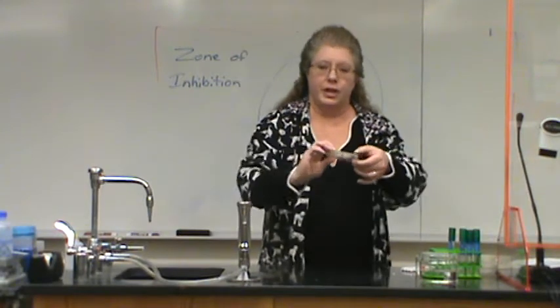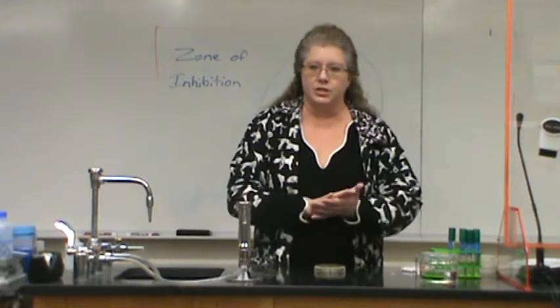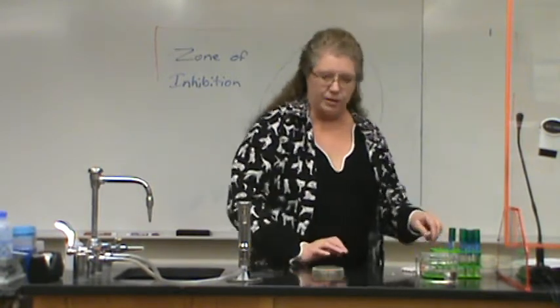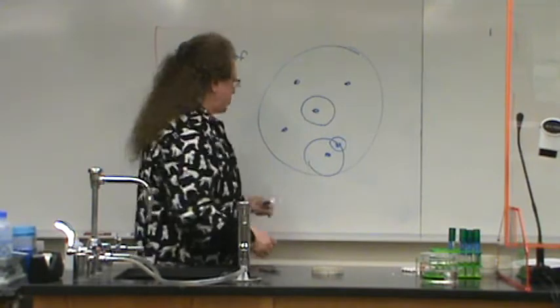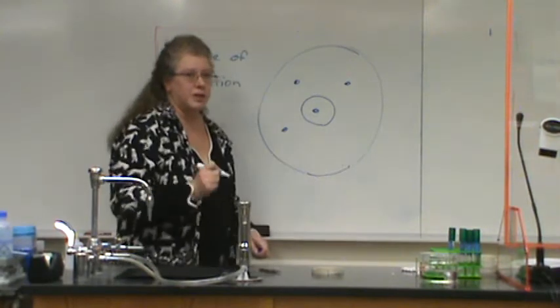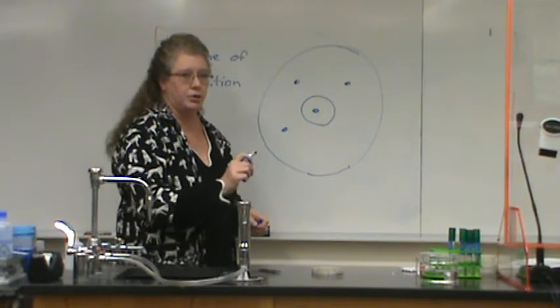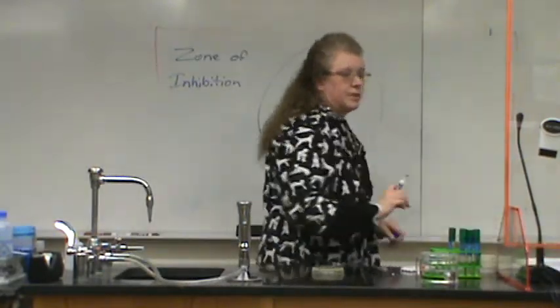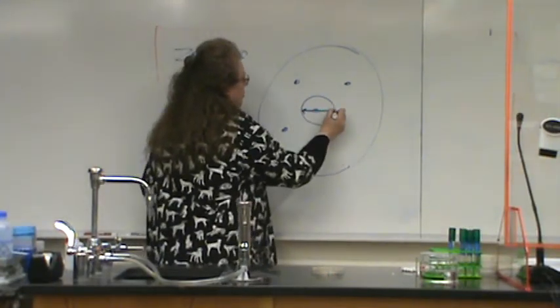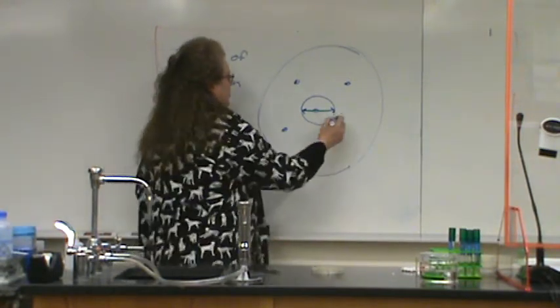After they're done, you can flip them over. They should stick to the agar, the little discs, and then incubate them. And then the results are given in a separate handout so that you can read the results by measuring. You'll be measuring the zone of inhibition in millimeters. Remember, this is a science class. It's in millimeters and it's not in centimeters, because when you go to rate it according to the table that is in the results section, you have to have millimeters. So you're measuring the diameter. That includes the disc in the middle, the diameter, in millimeters.